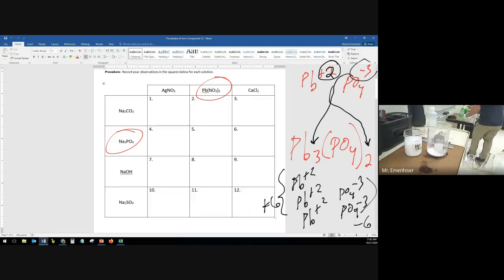Yum, yum. And if I filtered that, then I would get, actually, maybe I could take one of the filter papers that's done, like this one. Maybe I can reuse the filter. Let's take a look. Because I want to filter this one, because this one looks cool. So let's take this guy.